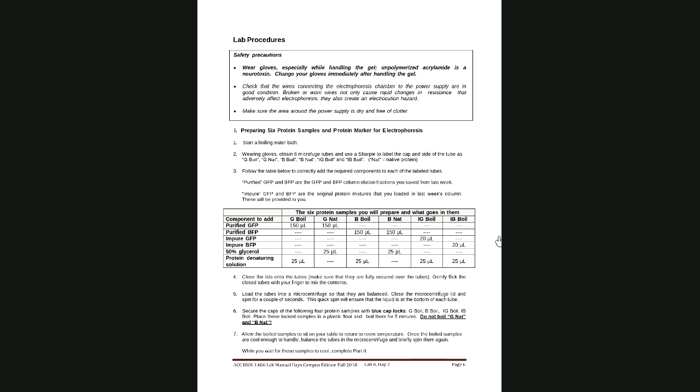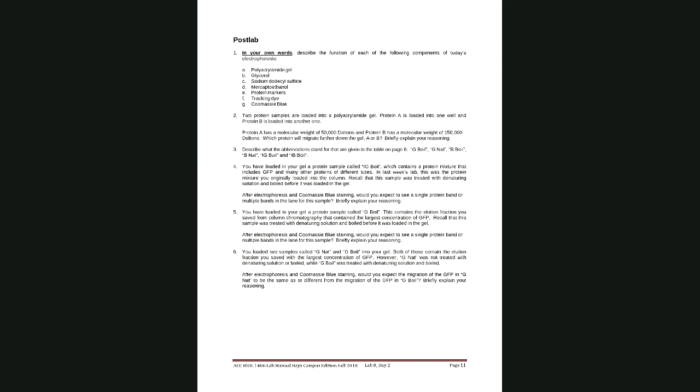Now let's see what else. Okay, I'm trying to get it. Also, it's going to ask you, what are these different components for? Make sure you give me good details. Just don't tell me polyacrylamide gel used to separate proteins. Okay, that's not going to cut it. You've got to give me more detail. Again, we're working towards Lab 8 Day 3.